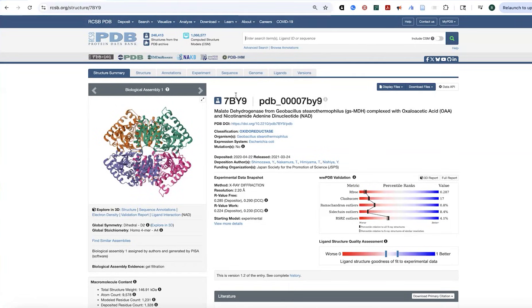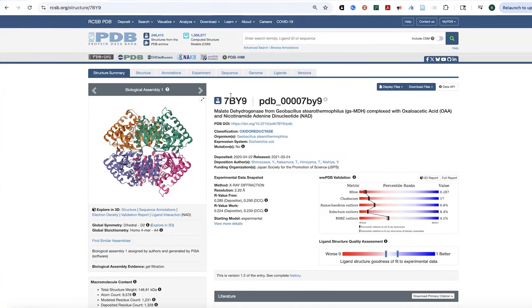So in this case, this example, I'm using this 7BY9, which is the malate dehydrogenase protein from this bacteria, bound to oxaloacetate, OAA, and NAD.